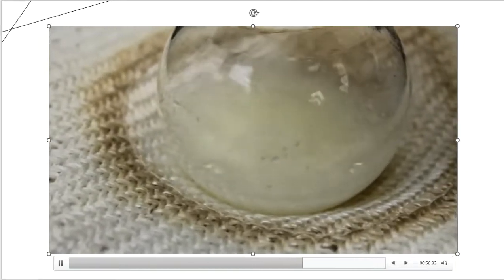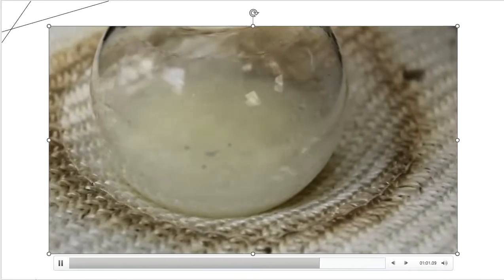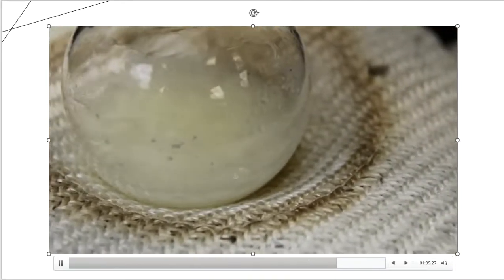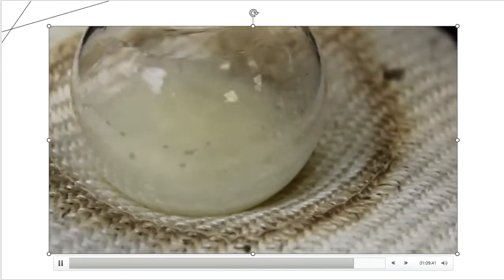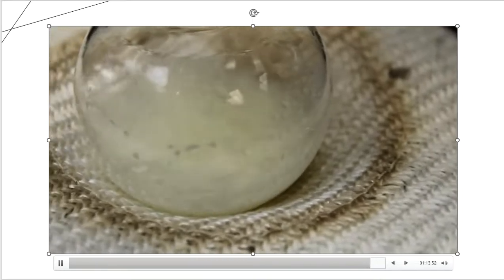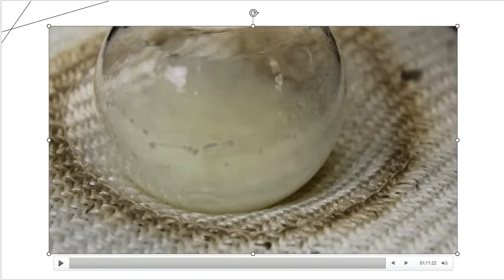All right, so once again, you can use this, make some observational changes, write those down into your lab book, but you are seeing that the crystals are dissolving. No longer are those actual crystals in solution. It's now just a milky, buttery type of looking liquid that I have in the boiling flask. So 30 minutes, we'll come back.